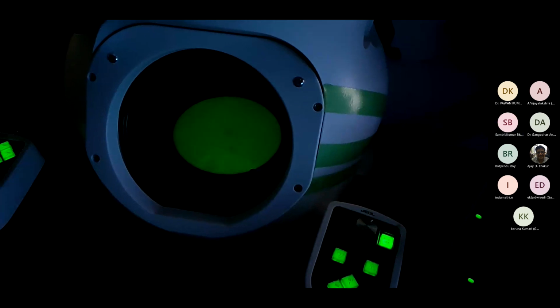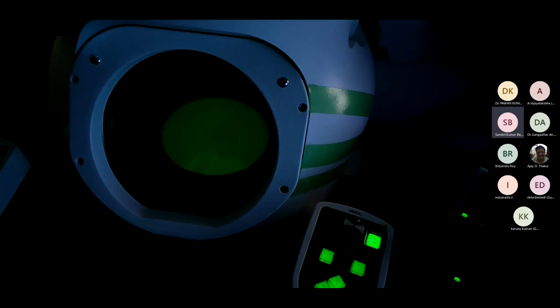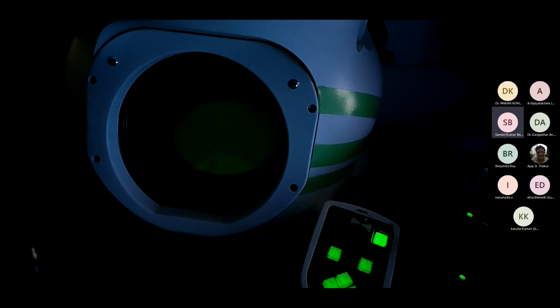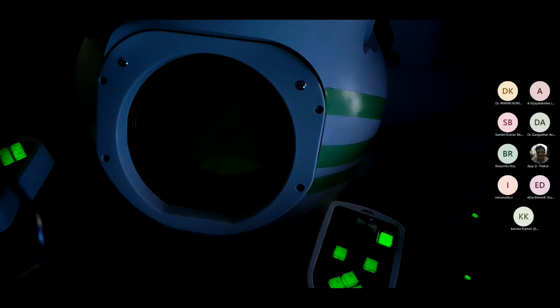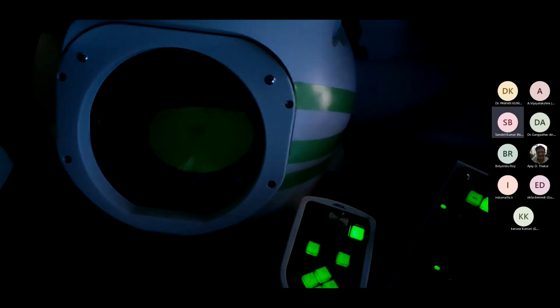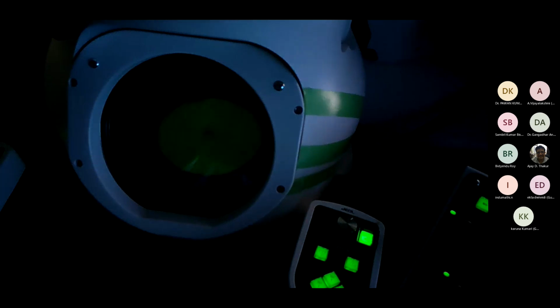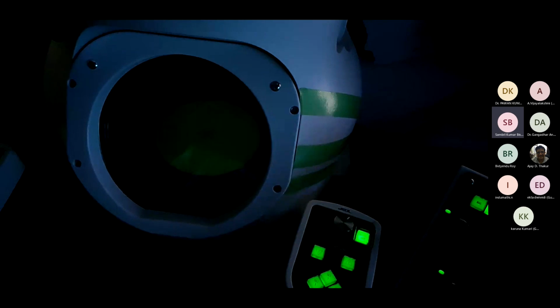So right now 15K is showing, 15, 20, 25. Okay, and 30K. So if you see the... okay. I was out of focus.